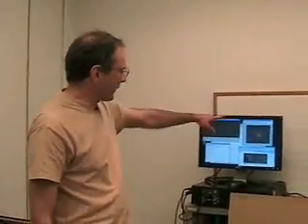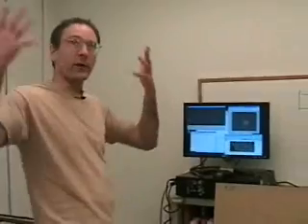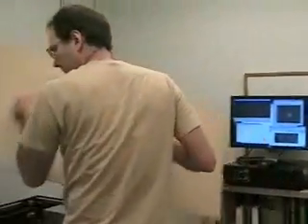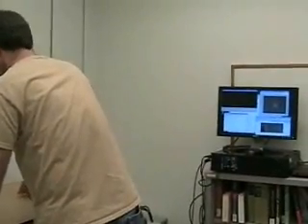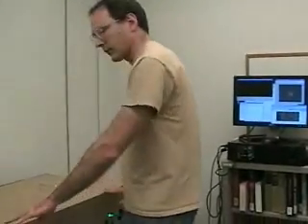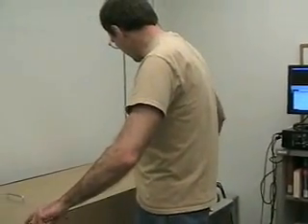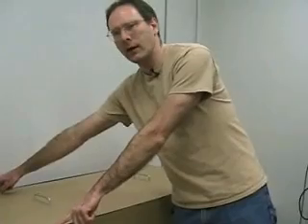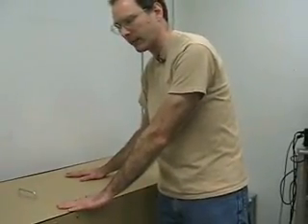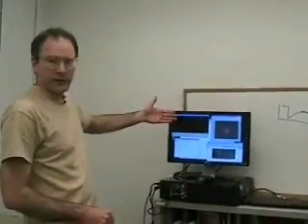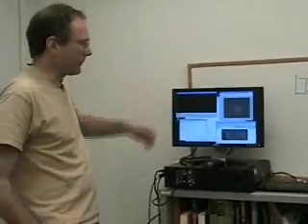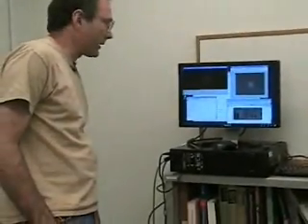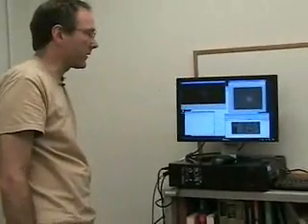And you'll see that this is relatively gray still, actually. It's not very black in my image. That's because of all the ambient light in the room. So I'm going to take the top and I'm going to put that down over the box. And now, because we're going to want to use the laser later, you have to make sure there are a bunch of spring-loaded interlock switches on this box. And you want to make sure that when you put the box top down, it actually clicks on all of them. If sometimes it's offset far enough it won't catch one of them, and then that will keep the laser from functioning later. So look how much darker this is now. We've blocked the room ambient light. It's practically black there. And when I open the shutter, the sample is much clearer.